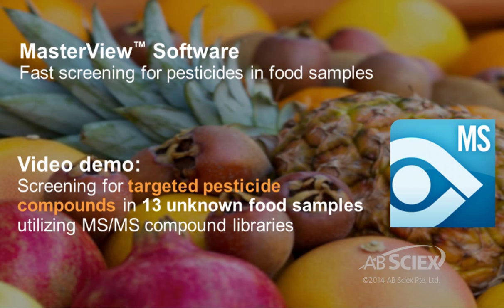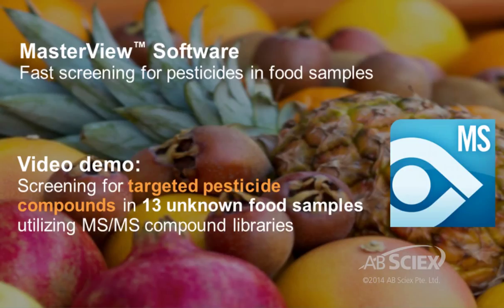In this short software demo, we will show you how you can quickly process batches of unknown food samples against a pesticide compound library to quickly detect and identify positive pesticides present in those samples.